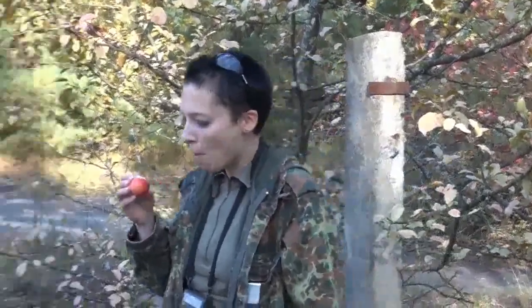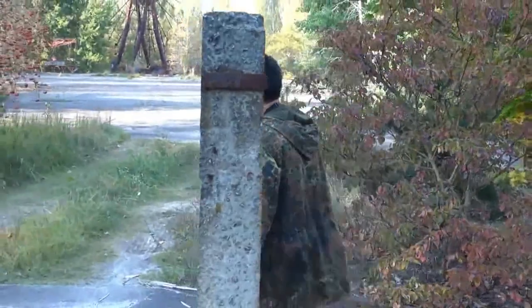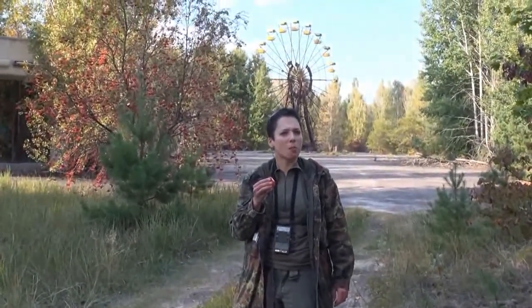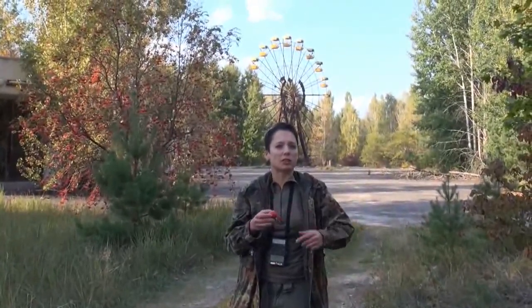But actually, you would have been in the right much more in regard to the mushrooms from Germany than in regard to this little apple that I collected just at the nuclear power plant, or very close to the nuclear power plant of Chernobyl. So, well, think about that. But yeah, as I said, it really depends. For example, cherries are supposed to contain much more cesium-137 than apples as well. I never found cherries, sadly, but I'd love to analyze those.